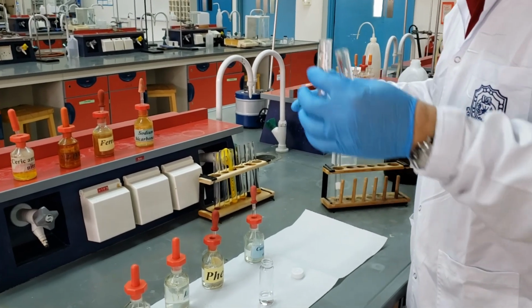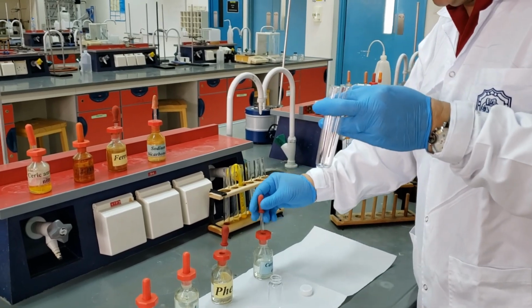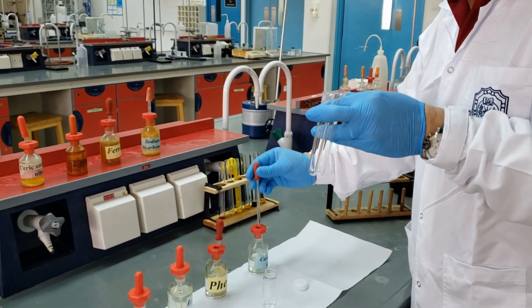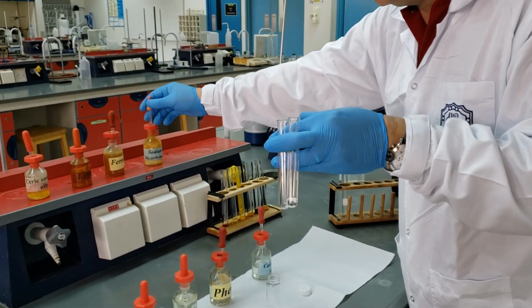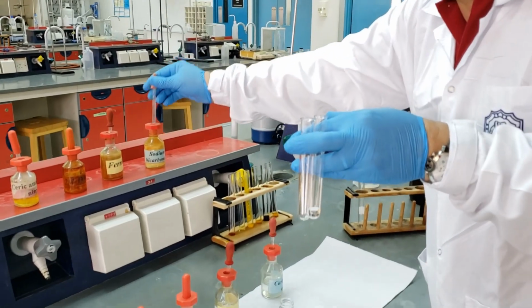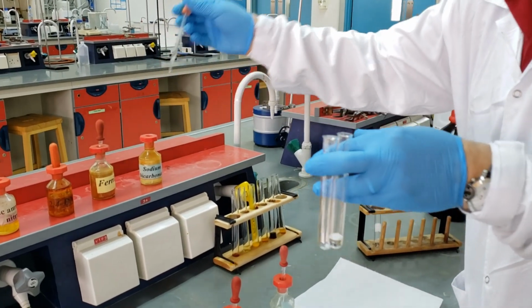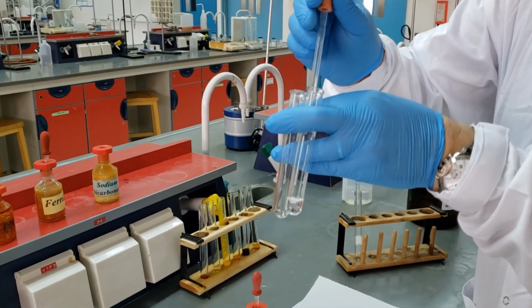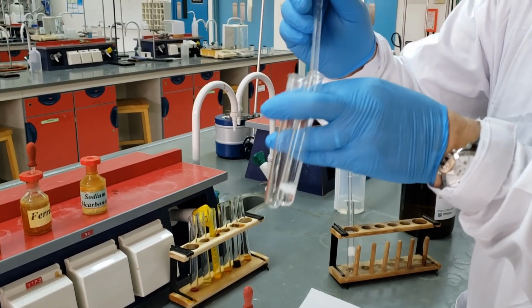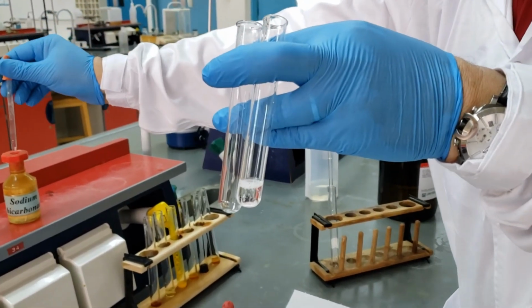The last chemical test we're going to do is the carboxylic acid test. So we take a known carboxylic acid, add it to one of the test tubes, then we add the reagent, which is sodium bicarbonate. We add approximately 1 milliliter of sodium bicarbonate for this experiment, and check carefully what's going to happen. You see, it's the evolution of a gas as an indication of the presence of carboxylic acid.